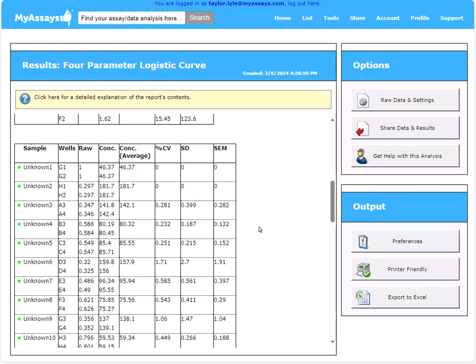Next, you'll see the sample table, including the sample ID, well location, raw values, concentration values for both replicates, the average concentrations, and percent CV, SD, and SEM for the replicates.